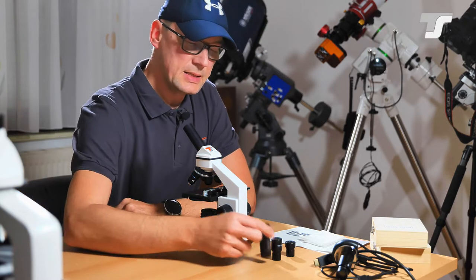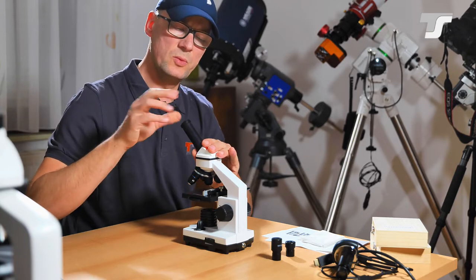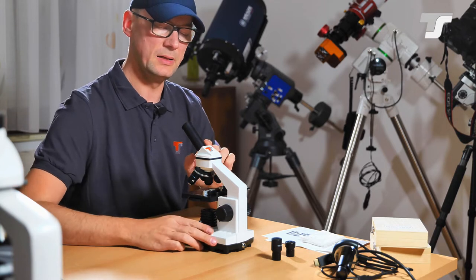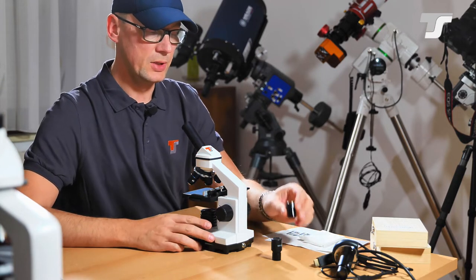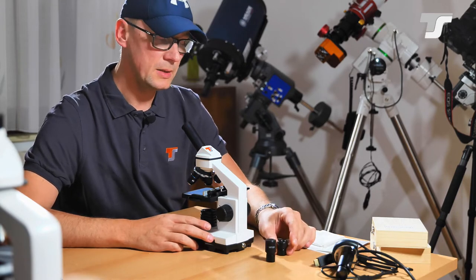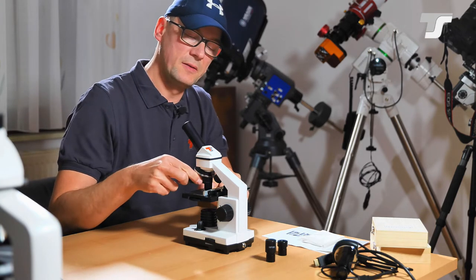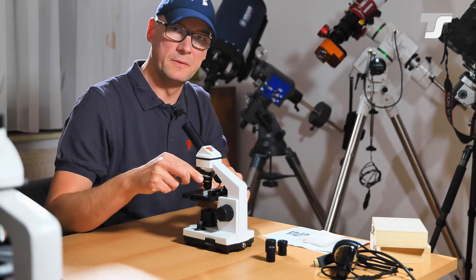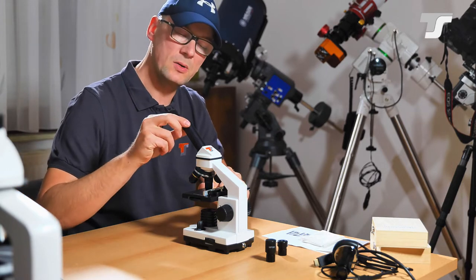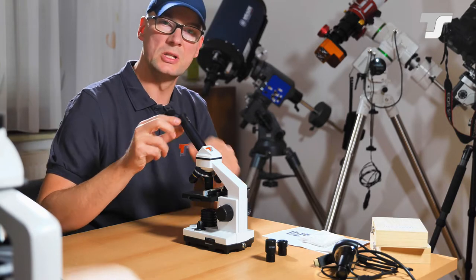The next thing is a projecting element which slides in here. Normally you will not see this, it's just completely in the tube. You get two eyepieces with it. A 10x eyepiece, the larger one, and the 16x. Together with this objective lens revolver with three objective lenses you can choose between six different magnifications. But you can also use this one to change the magnification seamlessly.